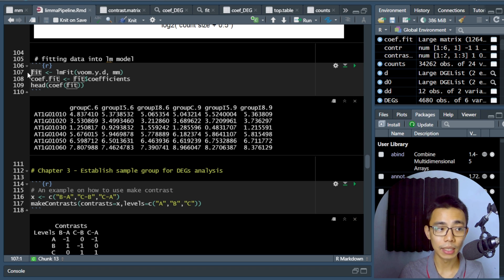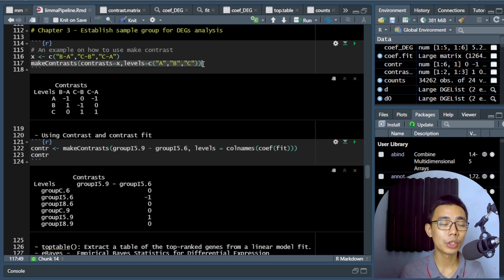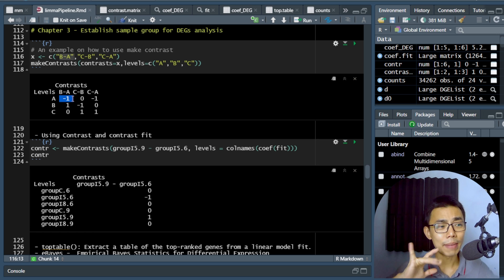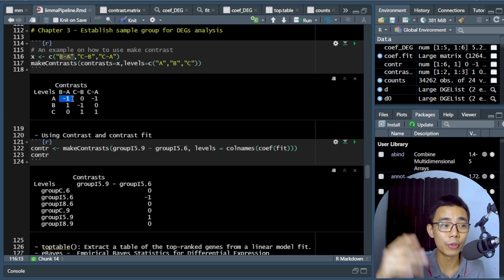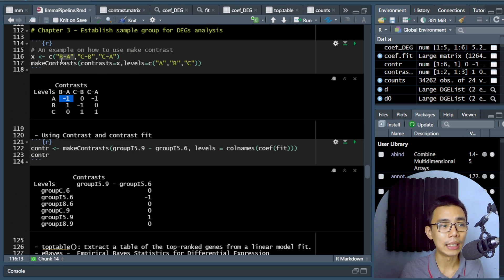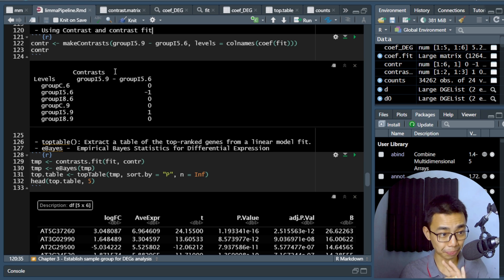Now we're in chapter 3: establishing the sample group comparisons for DEG analysis using the makeContrasts function. As an example, if you want to compare B vs A, C vs B, and C vs A, you write them as B-A and so on to create a contrast matrix. The sign of the log2 fold change tells you direction — a positive value means higher expression in B, lower in A. For first-time users, I recommend starting with just one contrast before expanding to multiple comparisons.